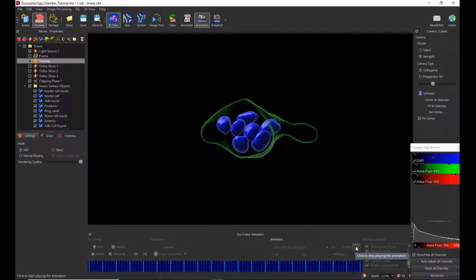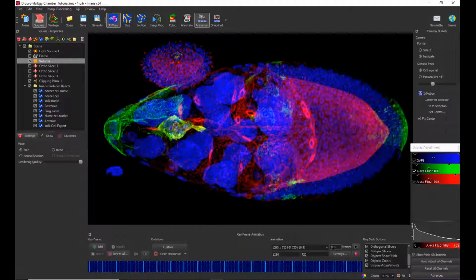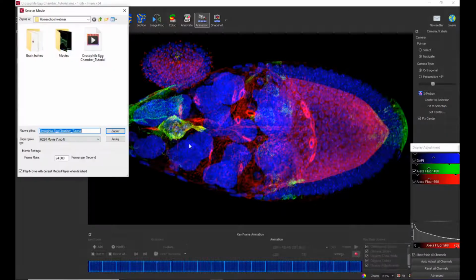object. So here you can tell that to render this movie 100 frames is not enough. Here to get the desired speed and the pace of transitions, it will probably be something close to 500 frames needed. So just adjust the number of frames to the number of keyframes you added and the desired speed of transition you need. Obviously, to save the movie, select the red button, pick the format and save.